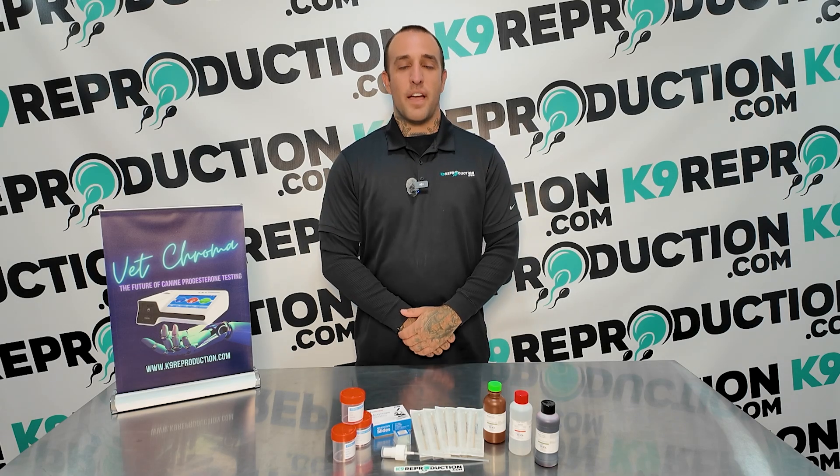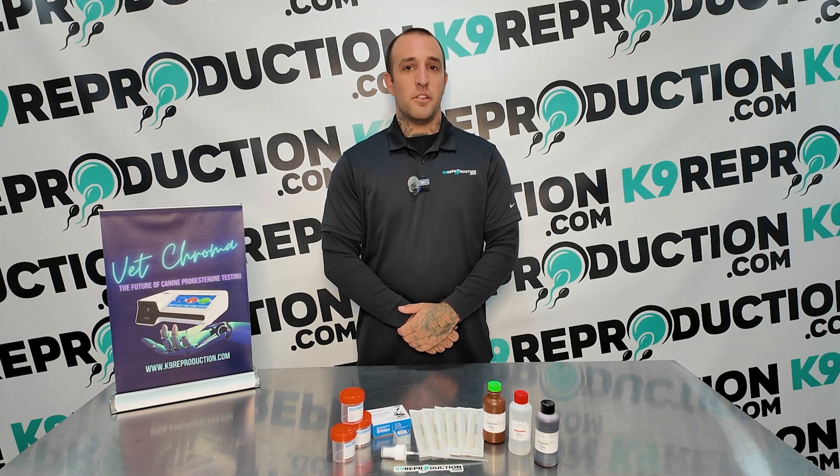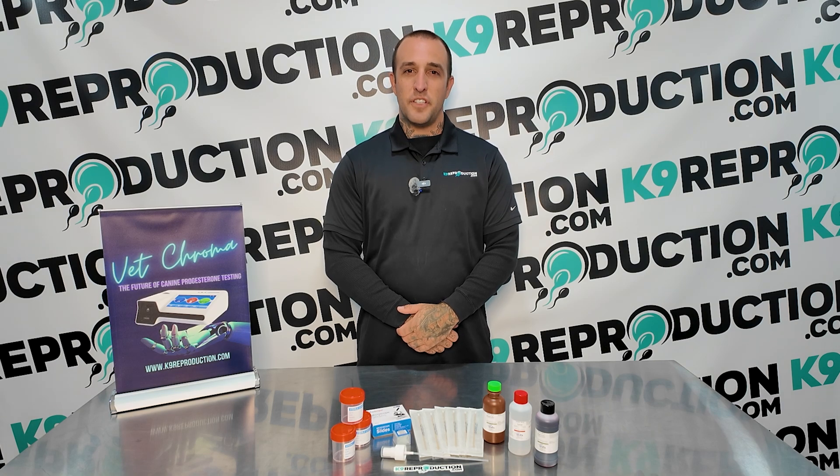Welcome to K9Reproduction.com. I'm Travis, and today I'll be demonstrating how to do a vaginal cytology on a dog to confirm her readiness for breeding. Today we'll be using the Hoak Labs Canine Cytology Kit, which includes everything you need for accurate and efficient testing.